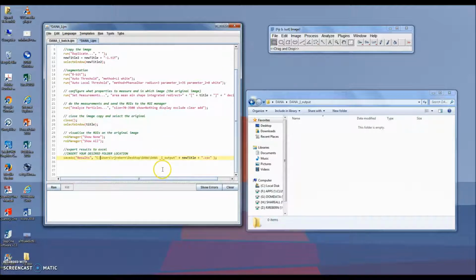One small caveat about this is that there need to be two backslashes instead of one separating the locations. When you complete this, you'll notice that it turns a pretty pink color. And you need two on the end there to separate our file path from our newly created file. So I'm going to save this, and then copy this file path.